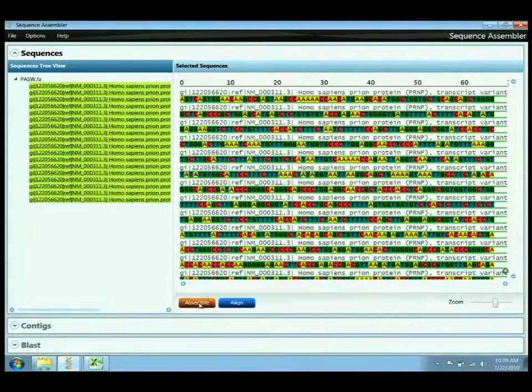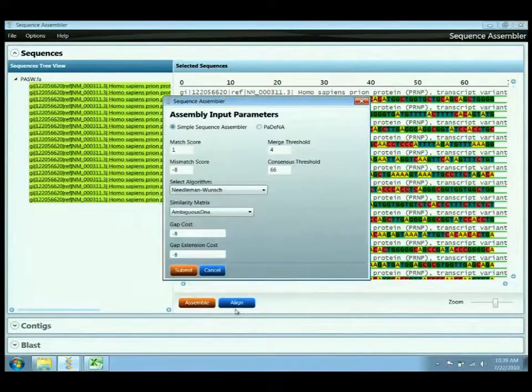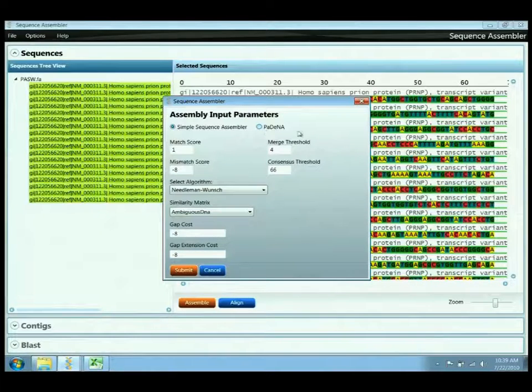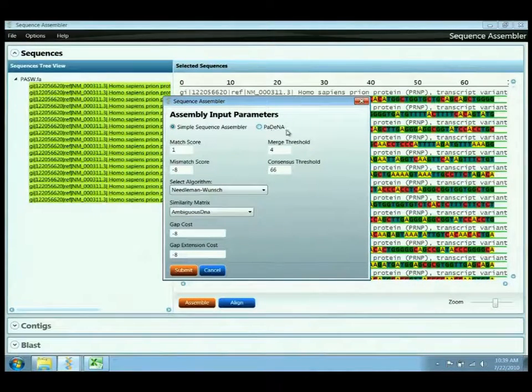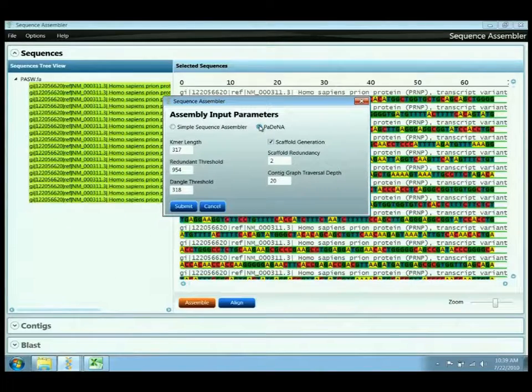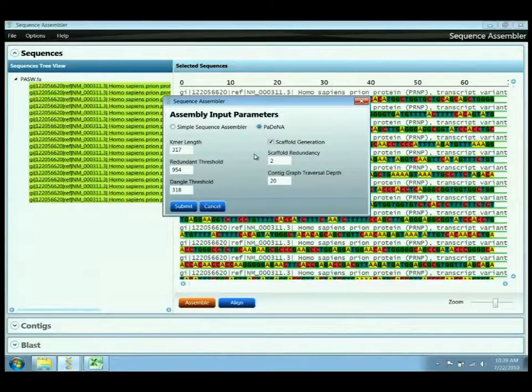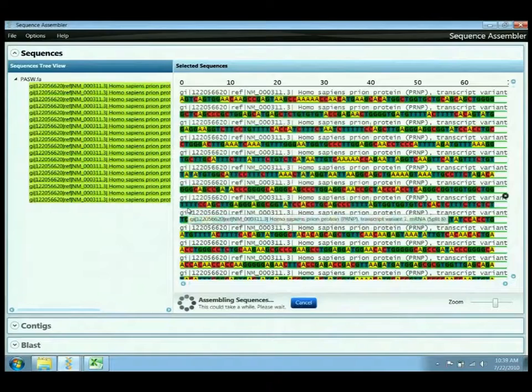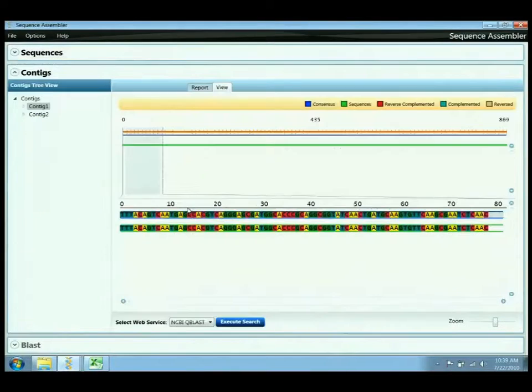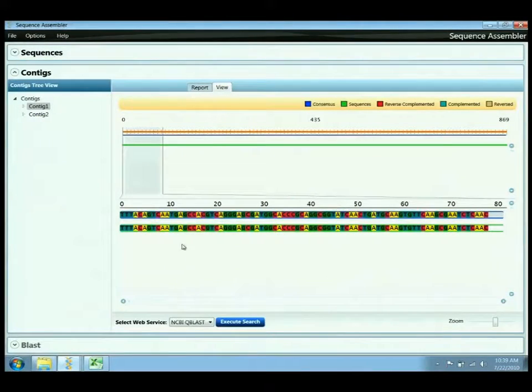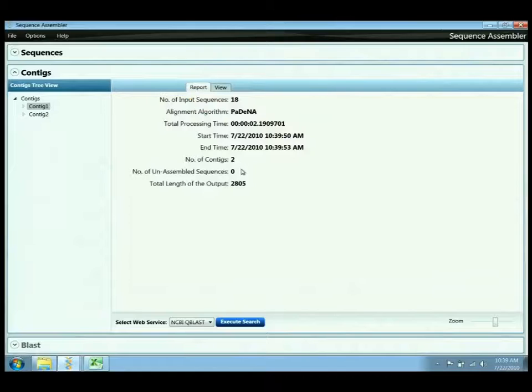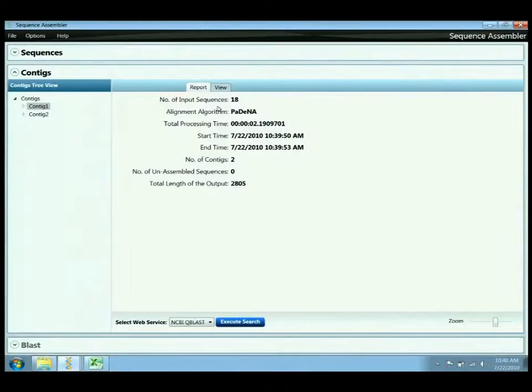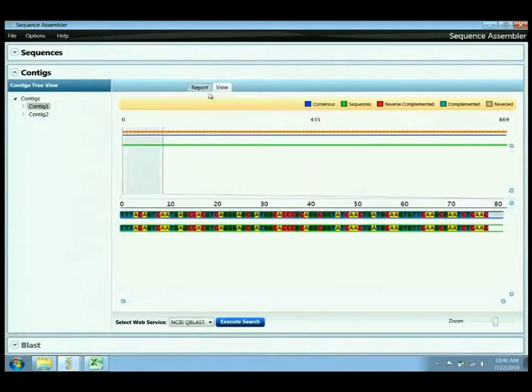The first thing I'd like to do is show how the assembly operation can occur with the Padina algorithm, the parallel de novo assembler. By selecting this option and submitting an assembly just using the default parameters, I get a very quick result. I've got 18 input sequences. It actually generated two contigs in just over two seconds.